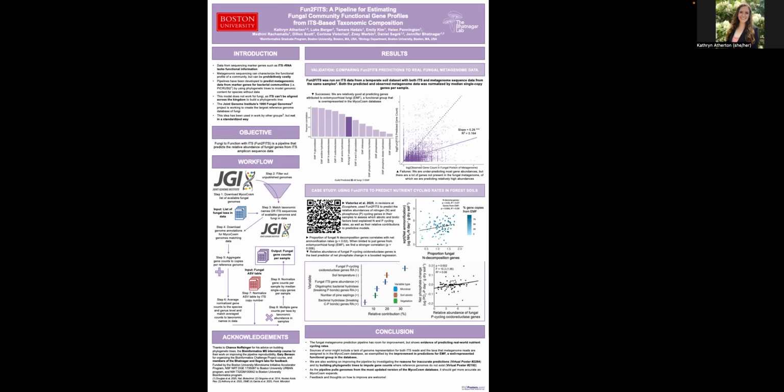First, some good news. Fun2FITS was relatively good at predicting genes associated with ectomycorrhizal fungi, or EMF. These fungi are heavily represented in the Mycocosm database, which likely helps our predictions. As shown in the bar plot, functional categories from EMF genes had higher correlations between predicted and observed counts. Now the less good news.